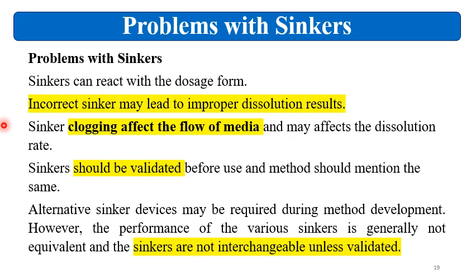The use of sinkers gives you the advantage of less variability and avoids the problem of floating or spinning or dancing of the formulation. But some problems are also there. Sinkers can react with the dosage form, that is a problem. Then an incorrect sinker may lead to improper dissolution results.